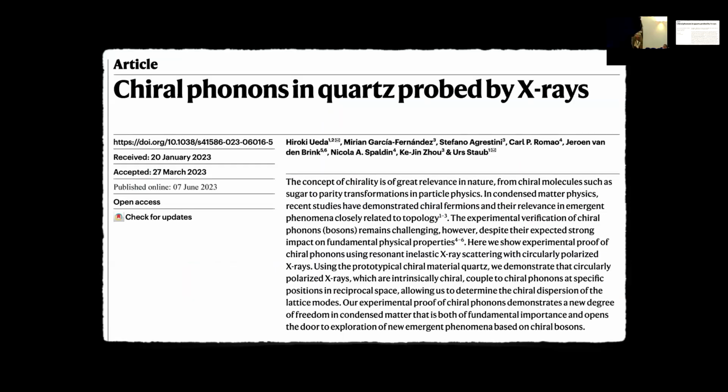Just to test, have you tried to calculate the MCD signal when the beam is on the manganese columns? Yeah, you don't get it. You don't even need to calculate it, you just have to measure it, but you don't get it.